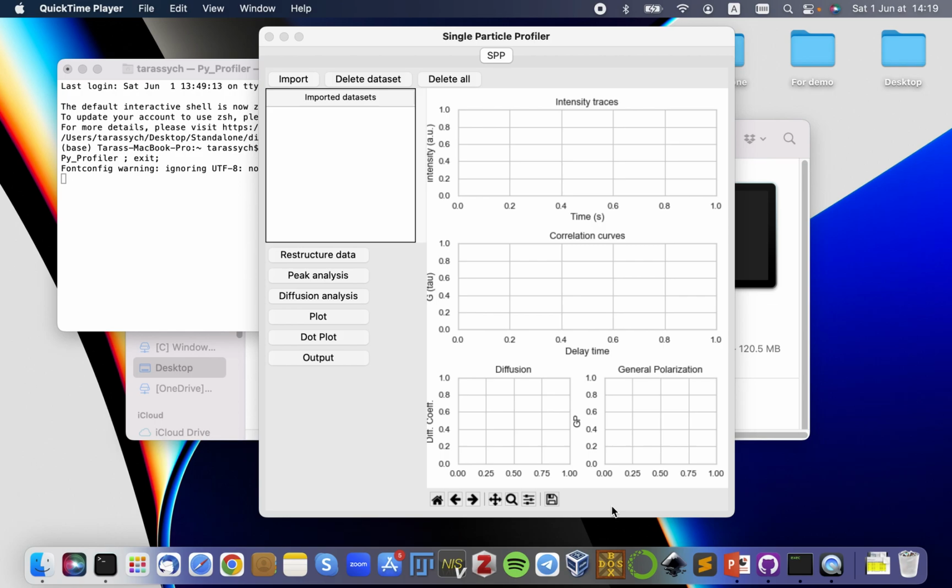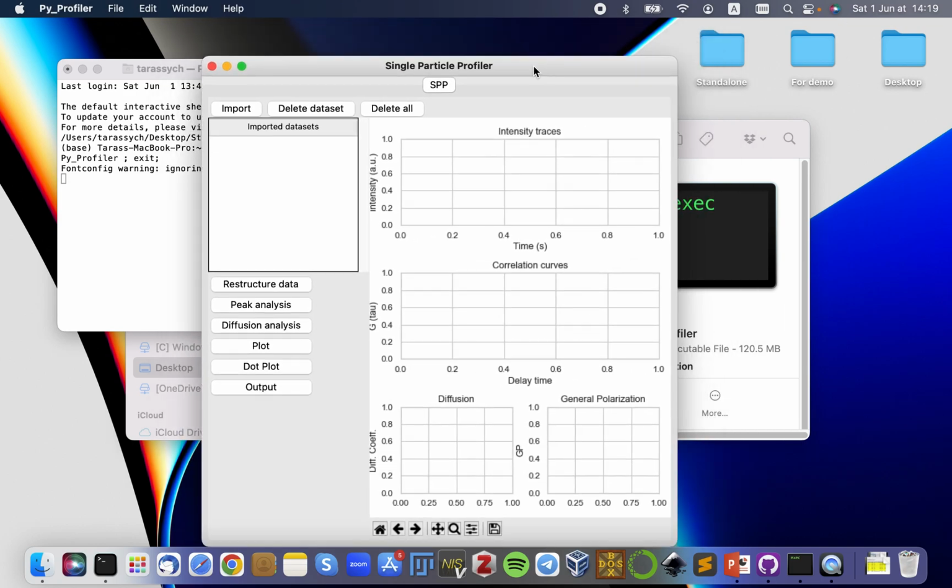In this video, I will show how to use the new version of the program, the new release, and I will also demonstrate a little bit how to work with a new type of files that are available as raw data or acquisition data or sources for this program.